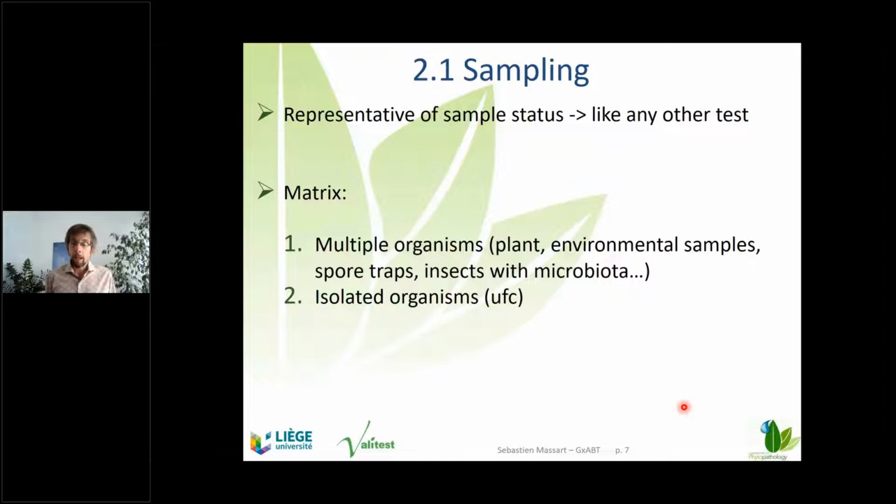So basically, you will apply similar rules as needed for any other technique. There might be minor adaptations, but at the end, it's the same. You need to have a sample which is representative of what needs to be tested. So, same problems as any other test, no real novelties.